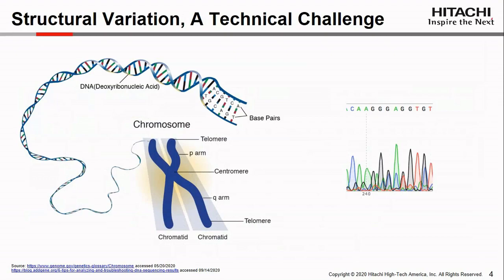If we look fundamentally and systematically at whole human genome structural variation analysis, we are at a state where sequencing is quite good at looking at single nucleotides in high complexity or multiplexing, and can routinely detect SNPs, small indels, and short tandem repeats.